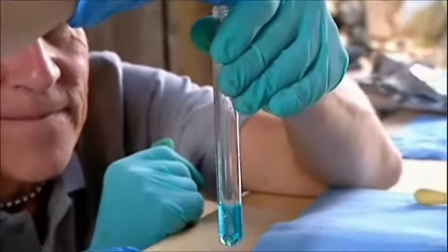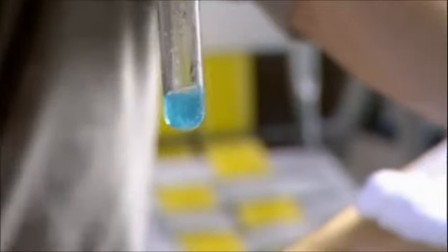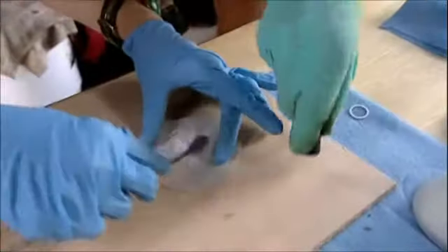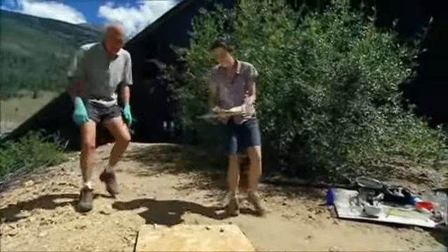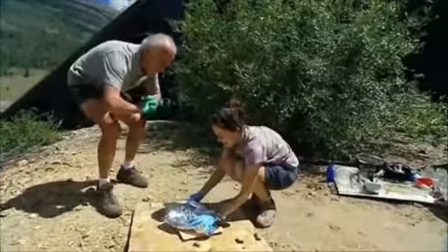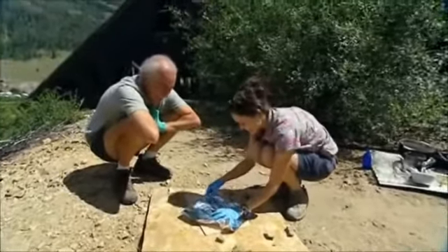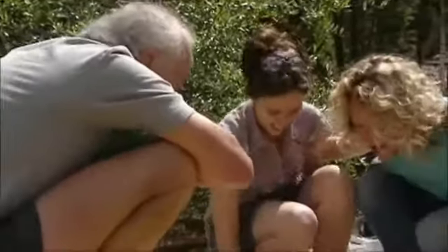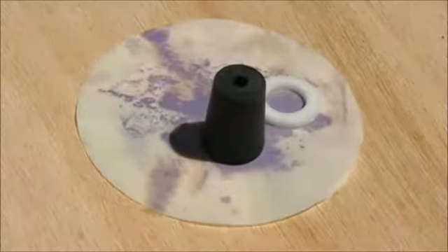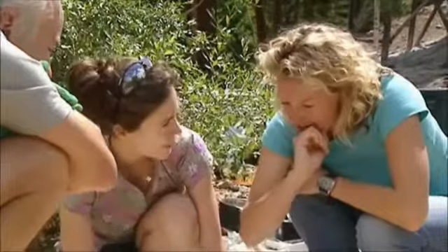Here we go. The final stage for Mike and Hermione is to add a pinch of table salt to their precious solution. If there really is silver nitrate in there, the salt will make it light sensitive. At last, they'll find out if all their hard work has paid off. If this chemical really is light sensitive, it should darken in sunlight. Okay, what's happening, guys? That was white a minute ago. This grey powder was white. When it's exposed to the sun, it just turns this beautiful purple colour.